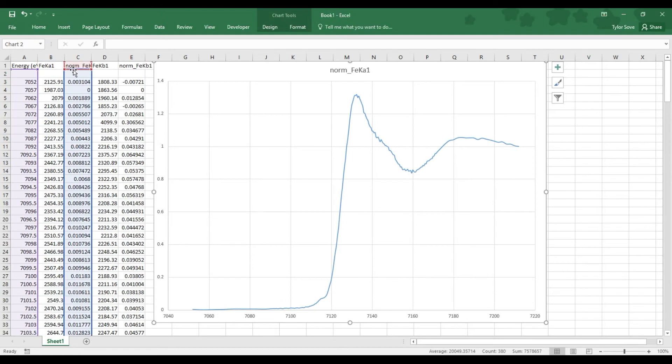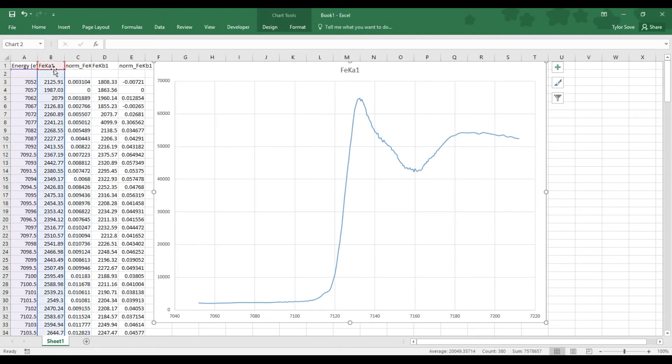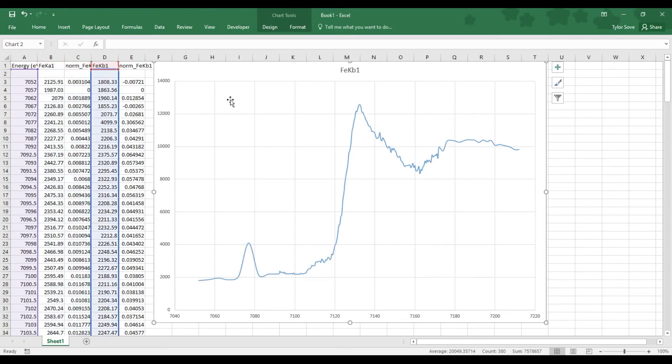Now to see the difference between the K-alpha to the K-beta, from the unnormalized K-alpha to the unnormalized K-beta is vastly different. They have a way different shape, but they both tell us it's the exact same element of iron.